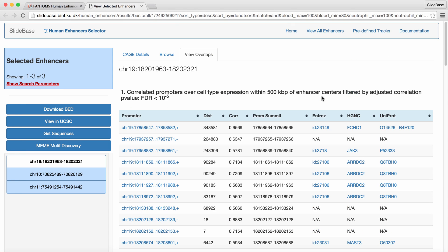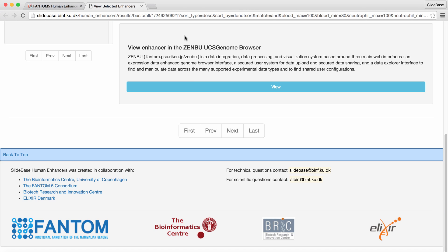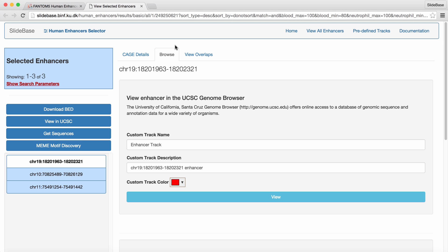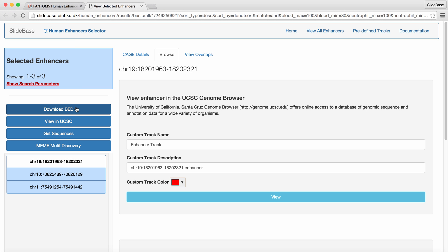If we move back to the second tab, we have the option of viewing the enhancer in the Phantom Zenbu genome browser, but we won't go into details about this. In addition to individual enhancers, we have the option of performing actions for all the resulting enhancers. We can download the enhancers as a BED file, view the enhancers in the UCSC genome browser, get the DNA for the enhancers, and perform sequence motif discovery using MEME. This concludes the enhancer use case, and next we will move to the promoter selector.